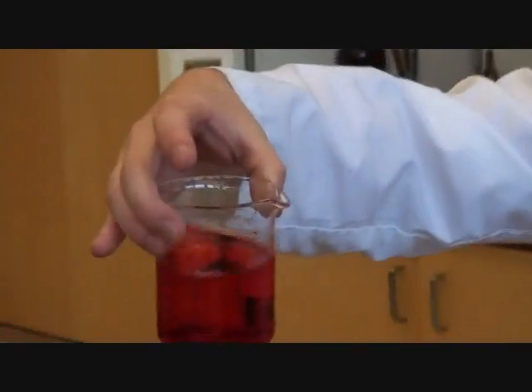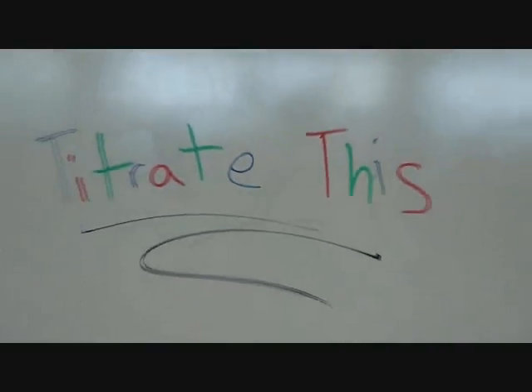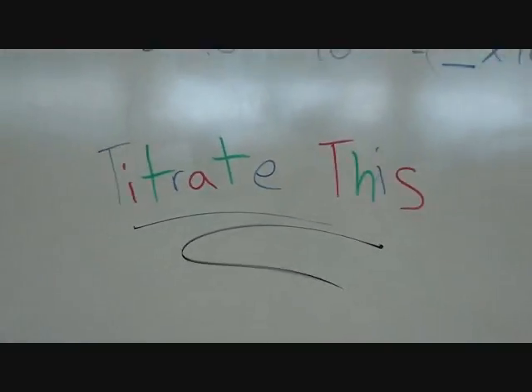Whoa, don't touch that acid. It'll burn your skin.